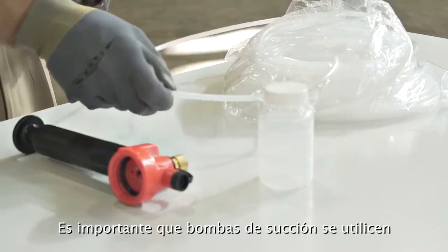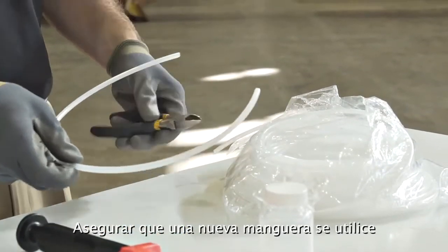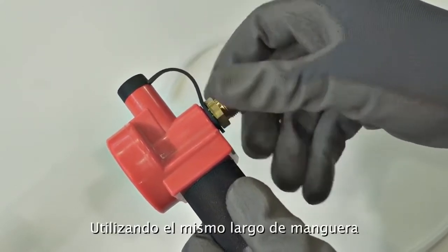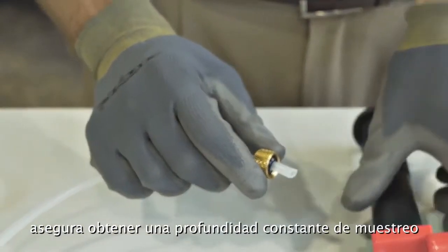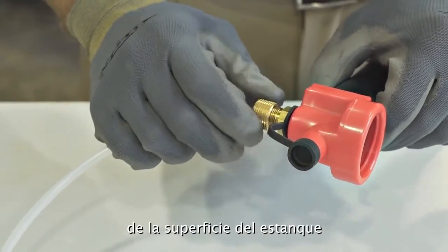Fluid in equipment that has not been operating and is cold allows information such as wear metals and contaminants to settle out in the reservoir. It is important that vacuum pumps are used with appropriate tubing. Make sure that new tubing is used for each sample in order to avoid cross-contamination. Using the same length of tubing each time you sample a particular reservoir helps ensure a consistent sampling depth within the reservoir. Aim for 1/3 to 2/3 from the surface of the fluid.